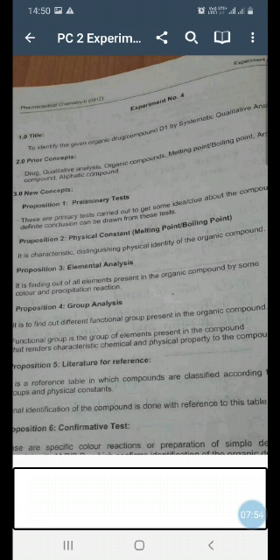What will I do? I will test my compound for carboxylic acid. Only the general test I will perform on the compound and find out whether the result is positive or not. If my result comes positive, I will stop there only. If my result is negative, I will just read the next name.